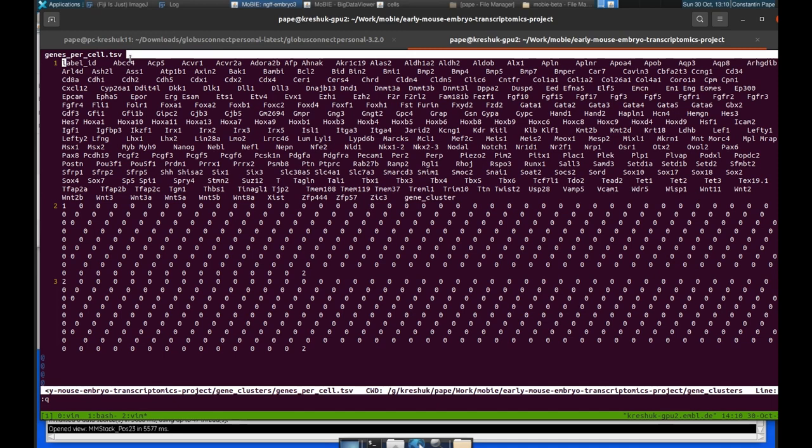You can see here the names of all of the columns. So the first one is the label ID. That's a very important column is the ID of each of the segmented cells. And we need that to be able to match to the segmented objects that are inside of Mobi. Then we have all the different gene names. And at the end, we have what we're really interested in, which is the gene clustering that we just computed.